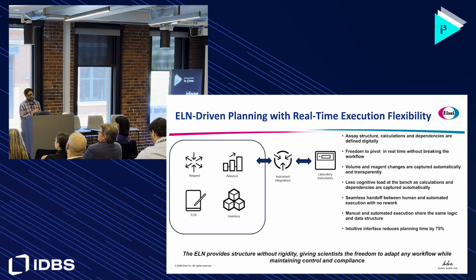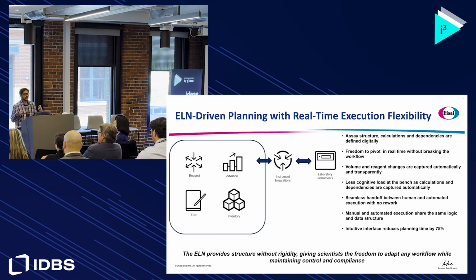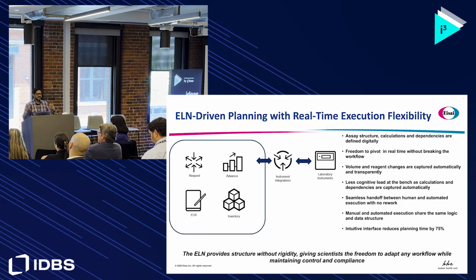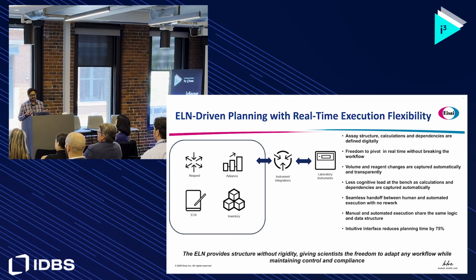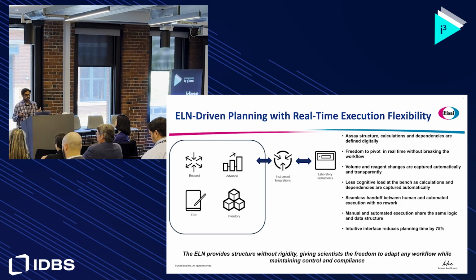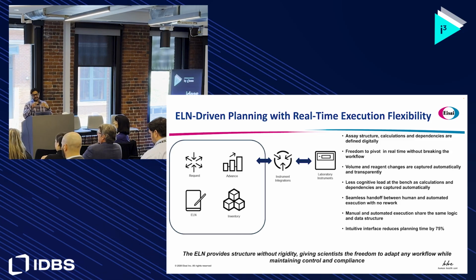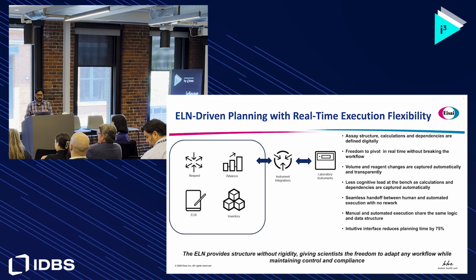Now, that is pretty straightforward, right? There's not a lot of intermediate work being done. You're not planning an assay, you're not doing calculations of dependencies, but we want to leverage these tools that we pay for to their fullest extent, right? So we want to maybe take this into other real bench work. That was all reagent setup. Now the reagents are stored. How are we going to use those reagents in our regular daily assay activities?